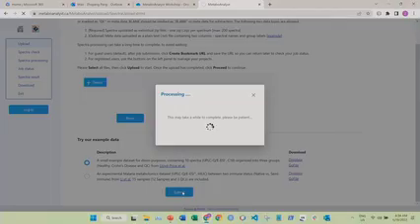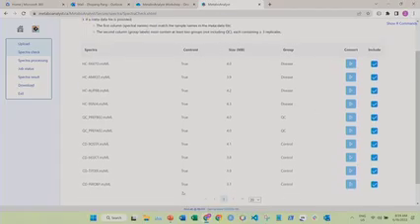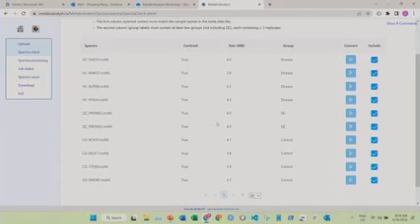So when you're doing the real demo, I really recommend that everyone use the first example also, because it's very small data. You use it for learning purposes. You can quickly learn how to use MetaboAnalyst for raw data processing without worrying about the data uploading or something. You don't need to wait for hours or several minutes to get the final result.